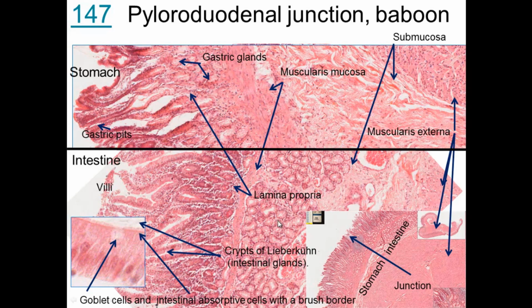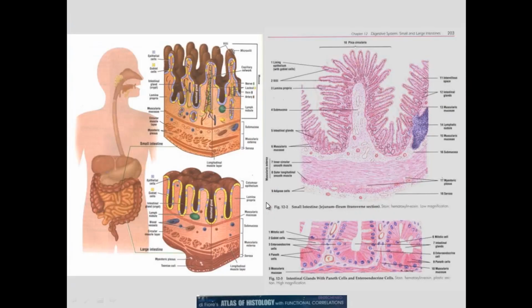In the duodenum, you have these glands. These are Brunner's glands, and they empty into the crypts of Lieberkühn. So they'd empty in here and finally discharge up to there. So in the small intestines, you have intestinal villi projecting through there. Sometimes the submucosa is enfolded in. But in the large intestines, you do not have intestinal villi.